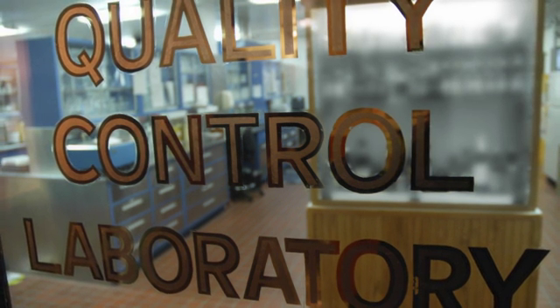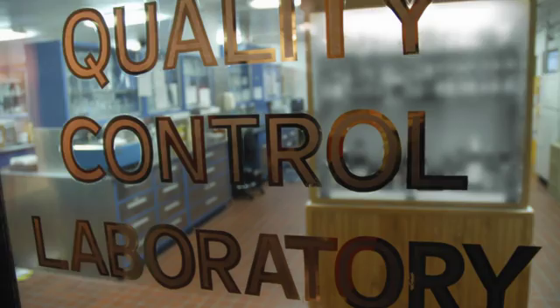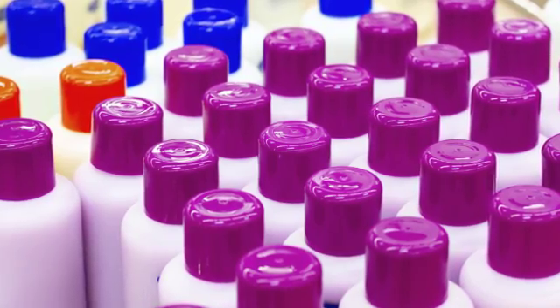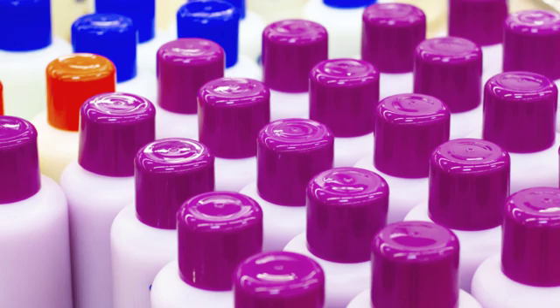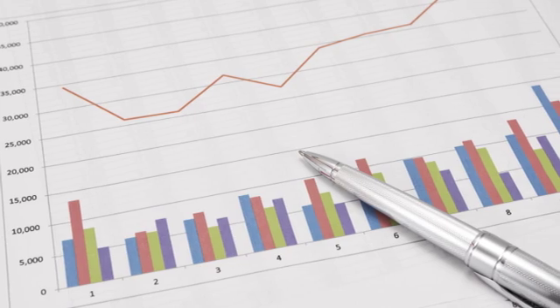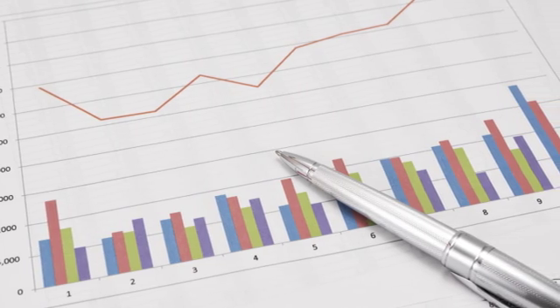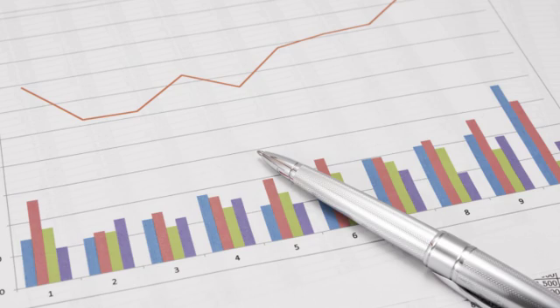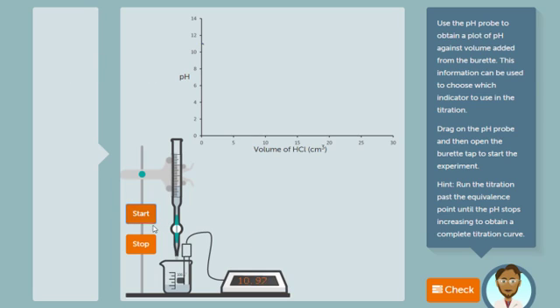As an analytical chemist at the testing laboratory, you will need to determine if there is a harmful amount of ammonia in the hair product. You will need to carry out your analysis accurately and efficiently as your results may be used as evidence in a court of law. In this activity, you will learn how to set up and run a titration experiment using a strong acid and a weak base.